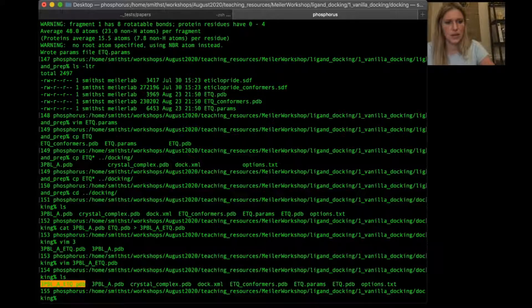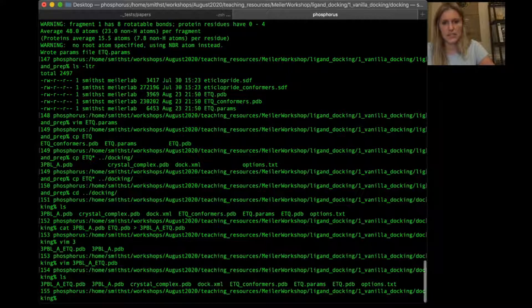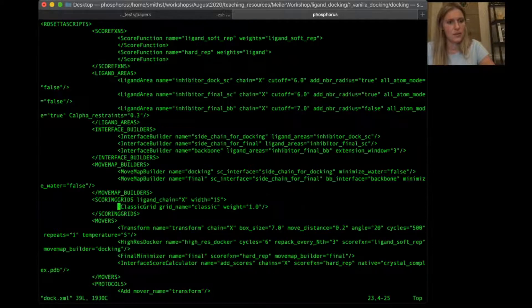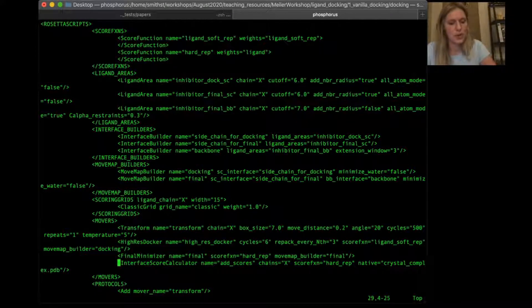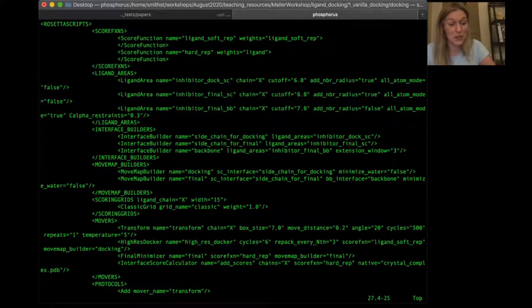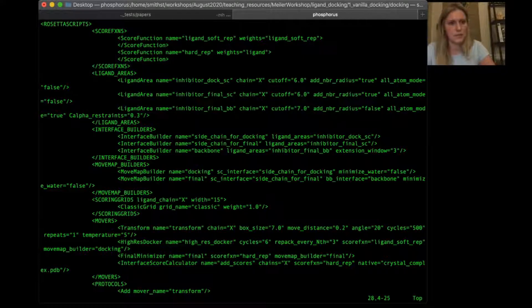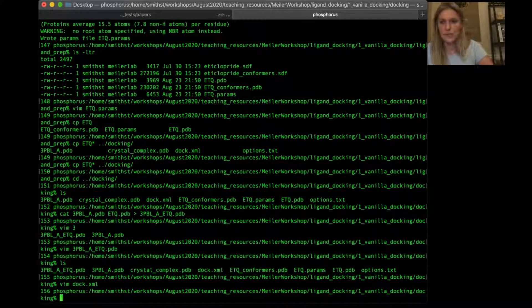We have a couple of other things in this directory: dock.xml and options.txt. Let's look at dock.xml — this is exactly the same file I used in the ligand docking presentation. It's a RosettaScripts file that gives all the information about the protocol you're running. Under the movers section we have our Transform mover, High-Res Docker, Final Minimizer, and Interface Score Calculator — all defined respectively throughout the XML. This is how we tell Rosetta what to do.